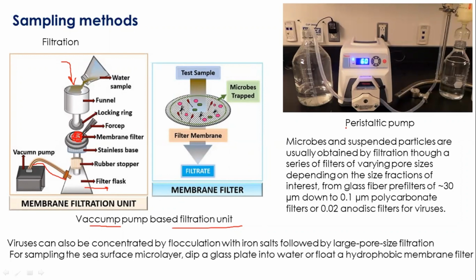And then there is another way to do the filtration, that is a peristaltic pump. In this there is no pressure on the water, because the peristaltic pump will pump the water in this direction, and then in here you can put the filter, a Sterivex filter.